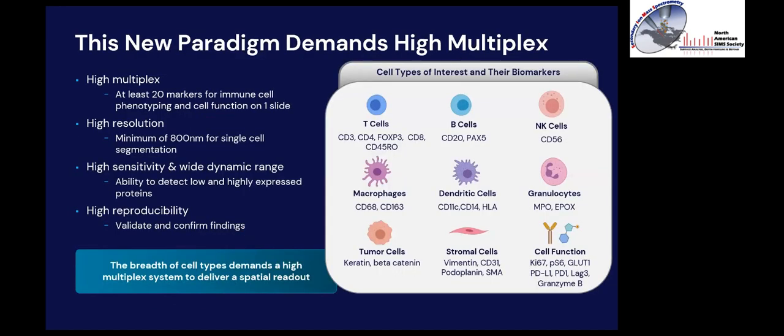And so in order to appreciate the number of different cell types there are within a particular microenvironment, we really need a highly multiplexed technique for that. And when I say highly multiplexed, I mean we need to be able to simultaneously analyze many, many different types of cells. And to do that with proteomics, we need to measure simultaneously many, many different proteins.